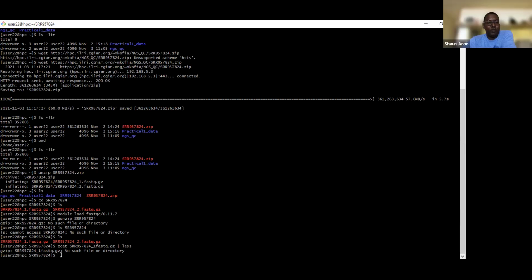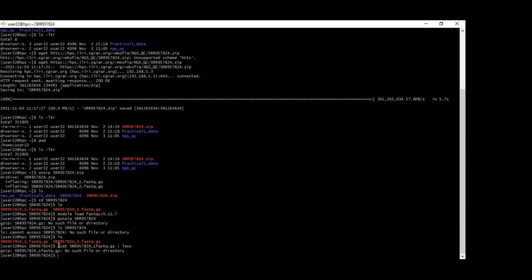You made a mistake in the file name. Oh, the file name. Use tab to complete it instead of typing the whole thing out. Okay. It was supposed to be. This is a name, is it?